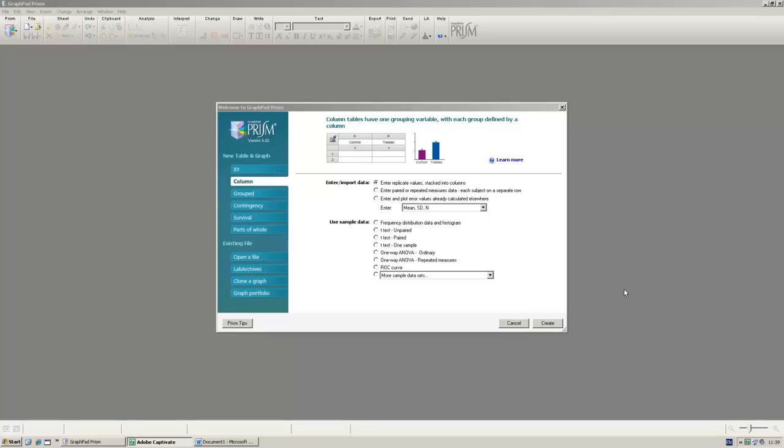to Excel, in that we're going to be looking at how to draw the basic graphs and do analysis on it. The one advantage Prism has is that it's quite intuitive, it's quite helpful, and once you get to know a little bit how the program works, which isn't difficult, it's quite easy to use.